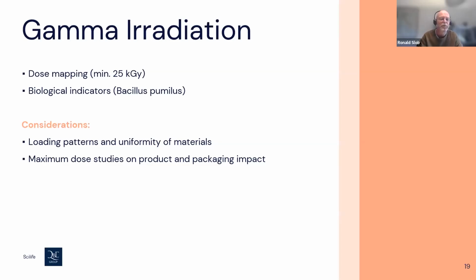And also look for the maximum dose studies, which I just mentioned shortly. If you put too much dose, you think, yeah, more is better, so I'm okay with that. But if you get very high dosages, it can also negatively affect your product or your packaging material. So enough is enough. Don't go overboard.